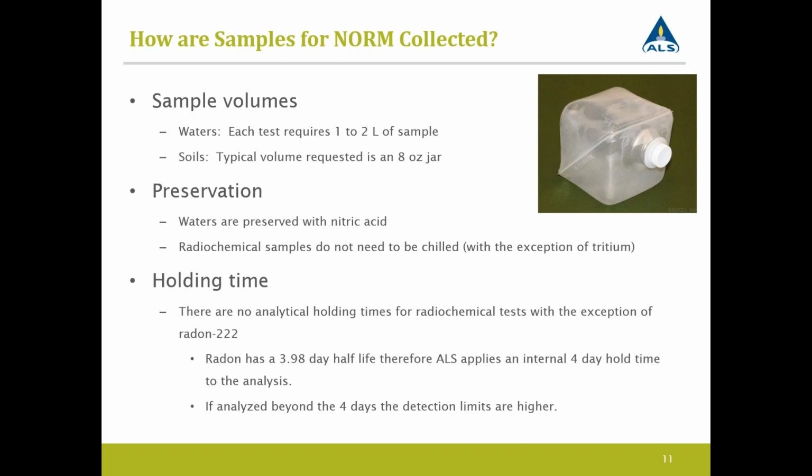on ice. We often get holding time questions on radiochemical analyses, and there are no holding times for these tests with the exception of radon-222. And for the radon, we apply an internal 4-day holding time to radon because it has a 3.98-day half-life, and it's to do with the analysis in that you can more easily meet a detection level if done within that 4 days, but it can still be analyzed after the 4 days. It just is a longer count time, and your detection levels may be raised.